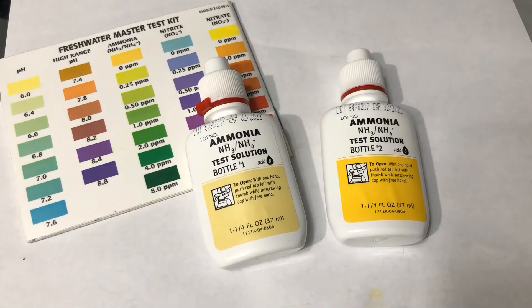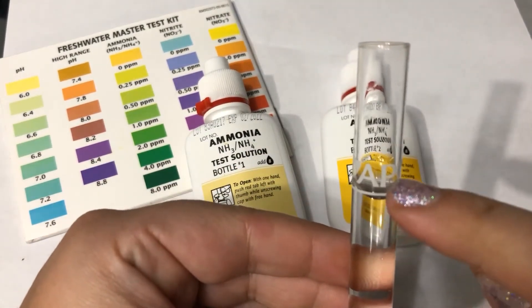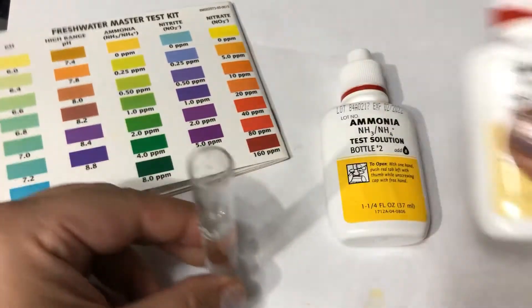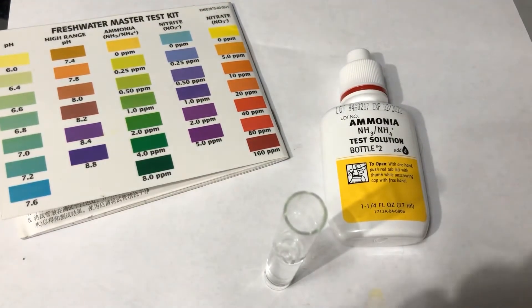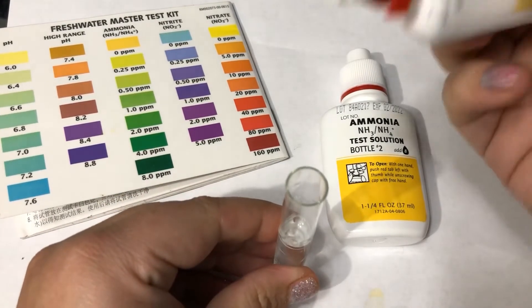Our next water quality test is ammonia, and this one actually requires two bottles of solution. I'm going to get five milliliters of water from the tank — I know it's five milliliters because the meniscus, that curve of the water, hits the line at the bottom of the curve. I'm going to open up bottle one and add eight drops, holding the bottle straight up and down so the drops are equal sizes.